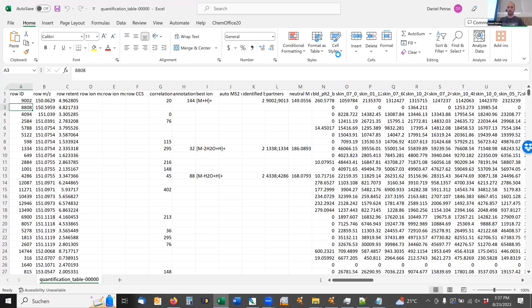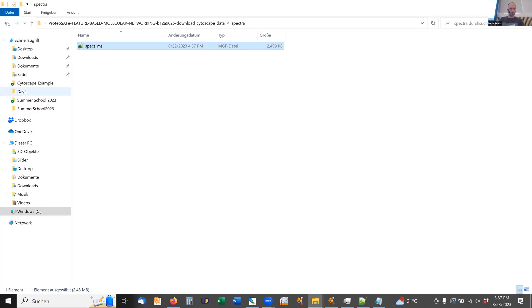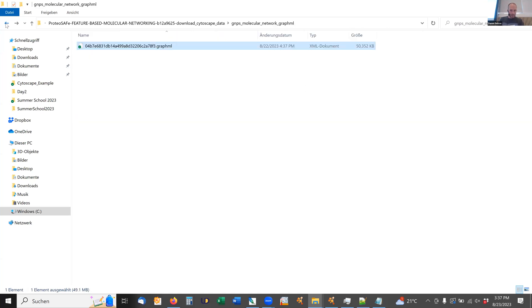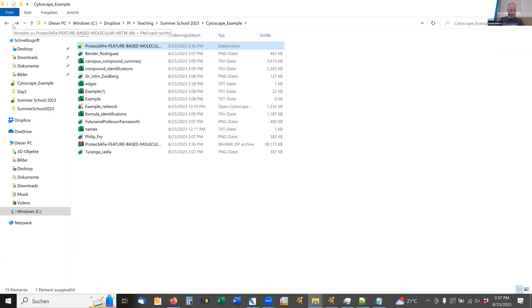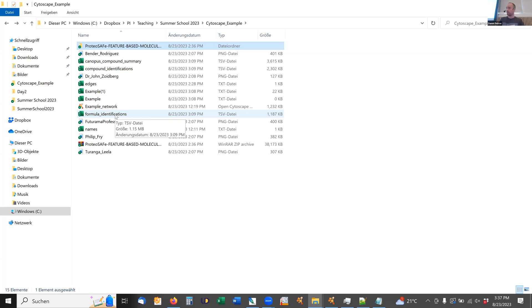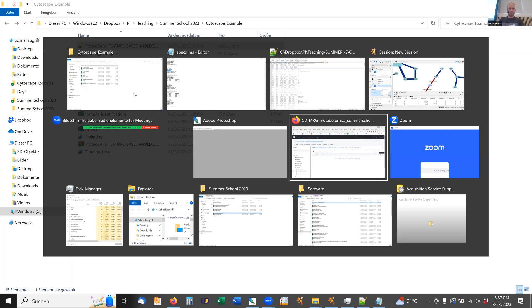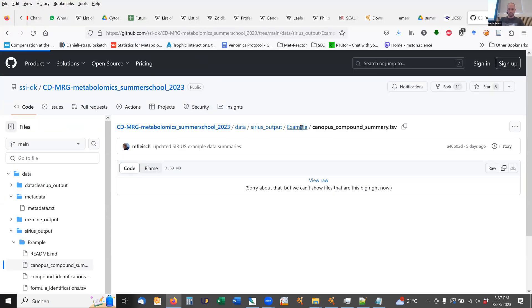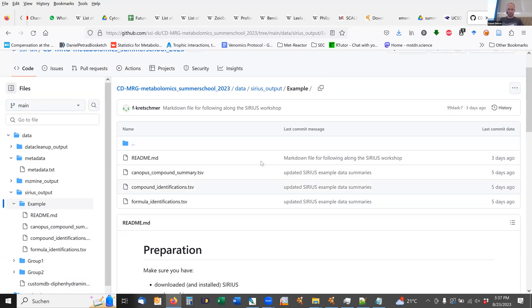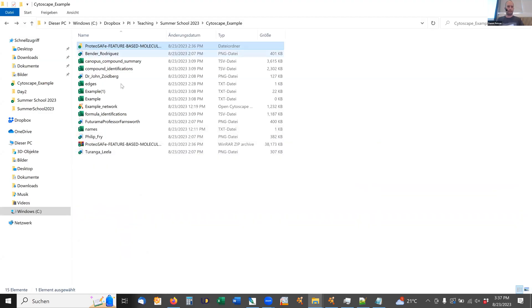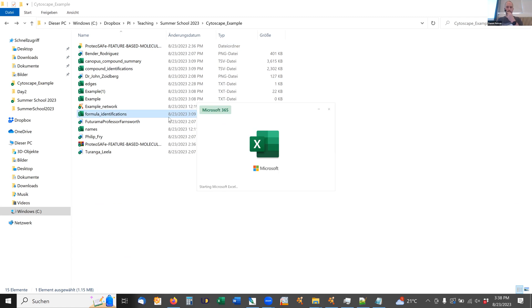Now if we look at the SIRIUS outputs, under compound identification, canopus compound summary, and also formula identification — those are the summary files you can download from SIRIUS or from the GitHub page. If you run it yourself, you should be able to generate those summaries. You can open them in Excel and look at that information. I don't remember the exact column header name, so I need to look at it to select the right one.